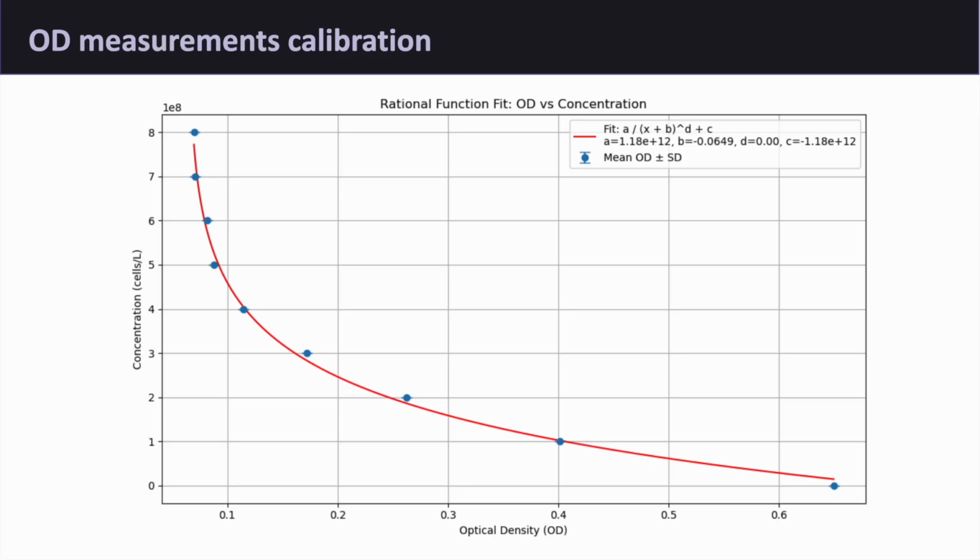After resolving initial epoxy curing issues, we successfully calibrated the OD sensor through real-life experiments. For each concentration, we recorded 10 OD measurements and used their averages as calibration points. The low standard deviations indicate the sensor provided highly precise readings.